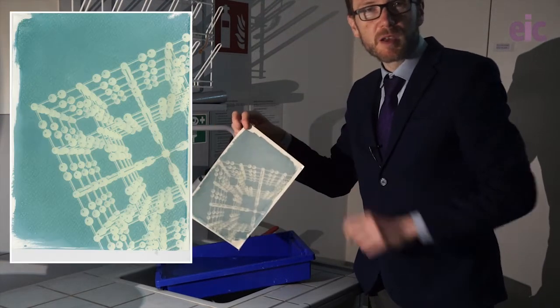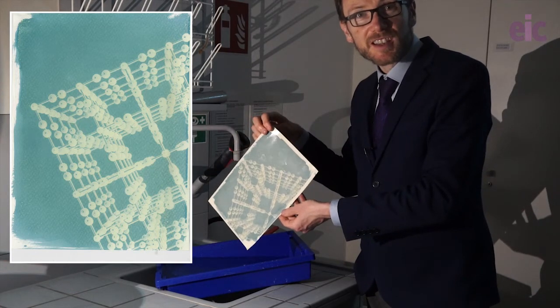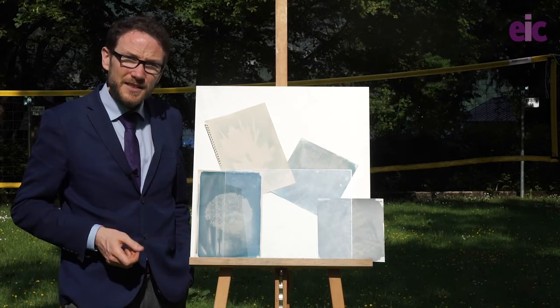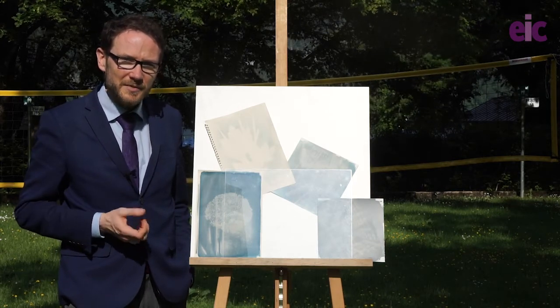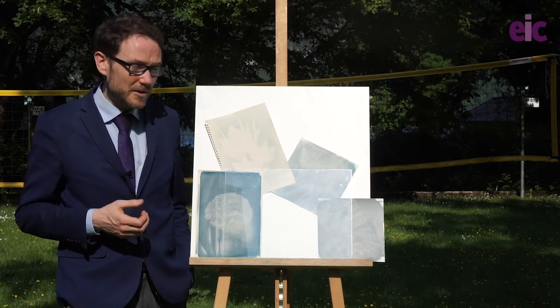And there we go — a nice permanent recording of our structure of Prussian blue, taken in cyanotype. So now we've covered the basics of getting a nice print, let me share with you a few of my mistakes from the past and some other ideas that might help you get the best results with your class.